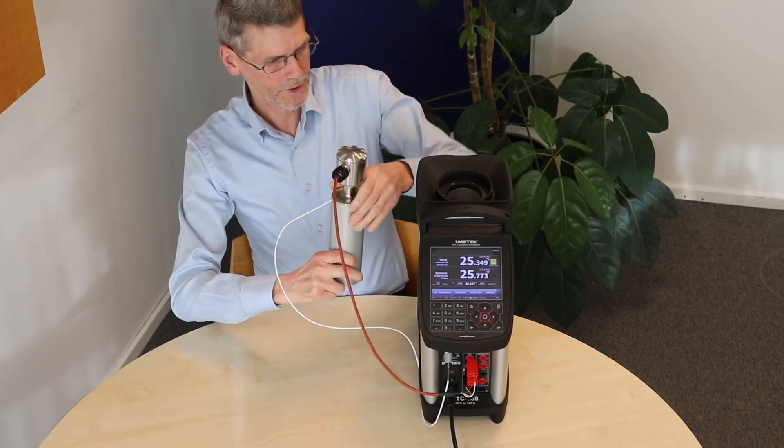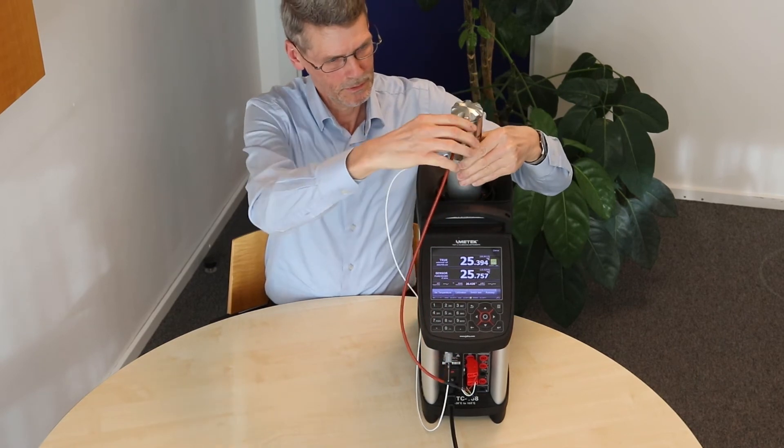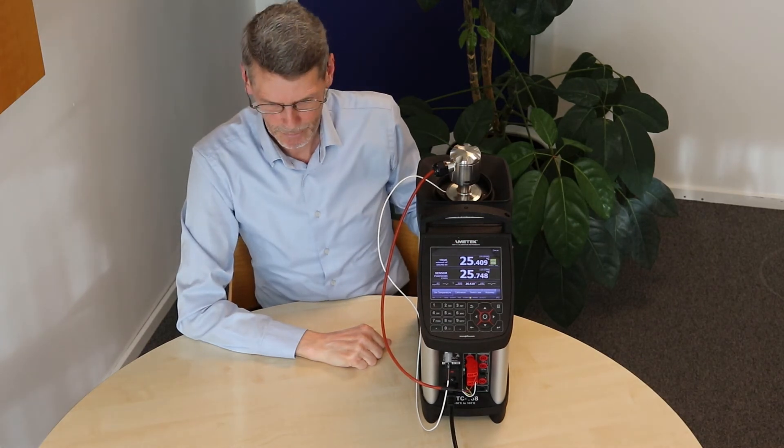So now it is ready. We can put it into the calibrator. Everything is ready and we can now set a temperature.